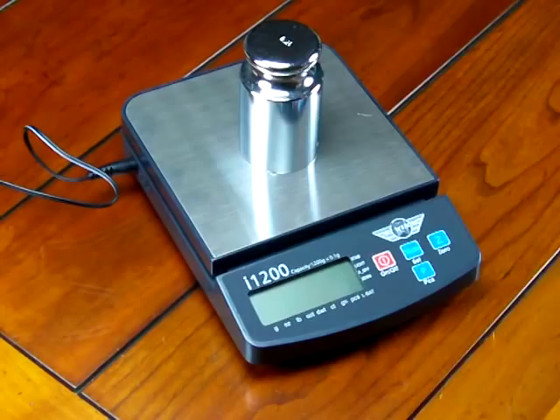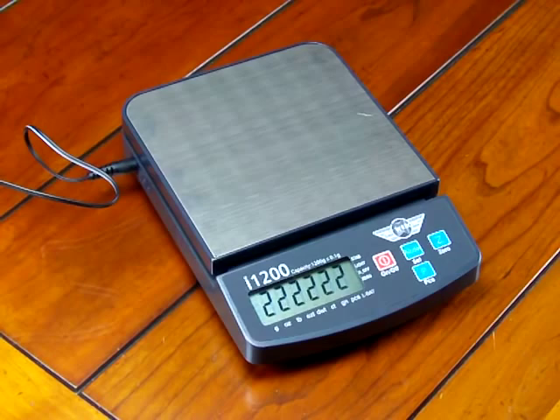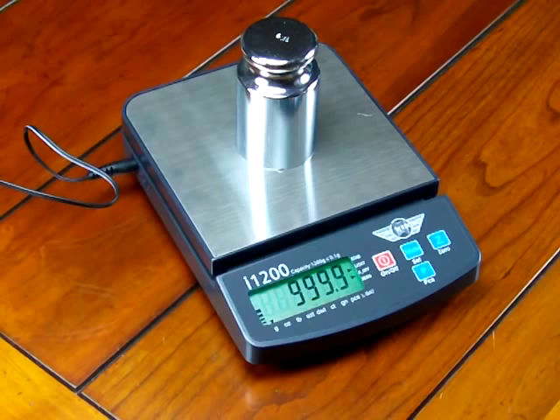take the calibration weight off the platform, turn the scale back on, and the scale will go through its countdown mode — this is testing the functionality of the electronics. The scale is now at 0.0. If I put on the 1000 gram mass, the scale reads 1000 grams.